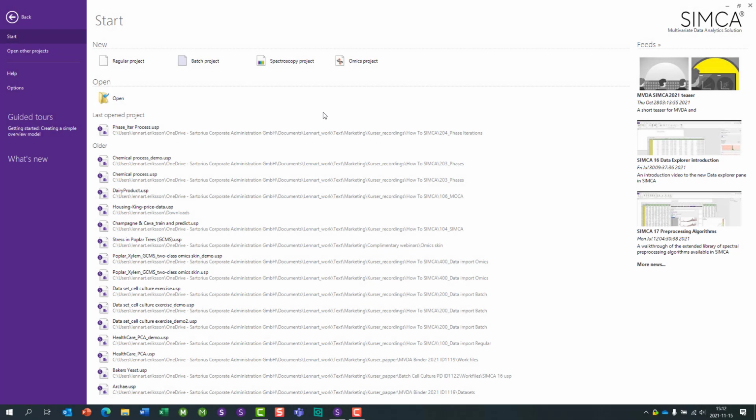In a multi-phase batch process, there can sometimes arise a situation where material in one phase going over to the next phase is divided in separate streams, forming so-called sub-batches. And maybe later on in another downstream phase, all material is again joined in the same main product stream.